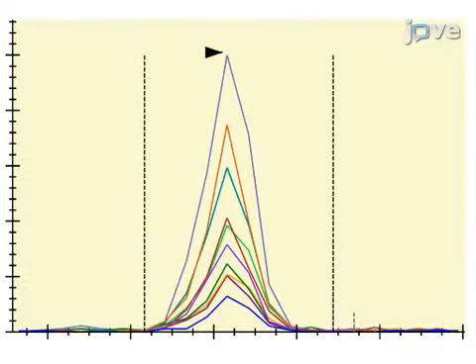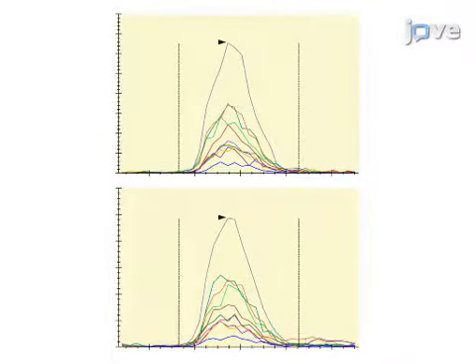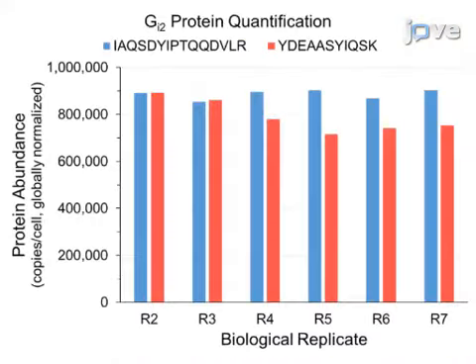Qualitative LC-SRM analysis of the biological samples typically resulted in more background signal, but most of the peptide targets were confidently identified. Quantitative LC-SRM was performed using internal peptide standards spiked into the biological samples. The resulting protein abundance values were consistent across the biological replicates and the 2 target peptides per target protein.